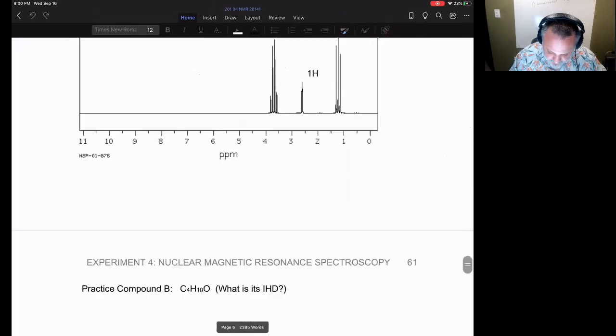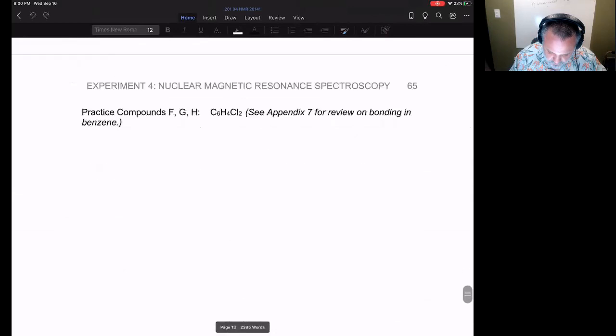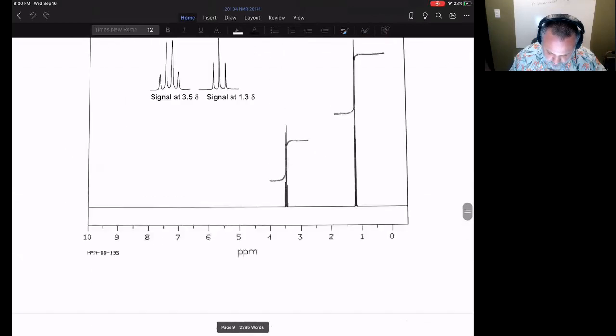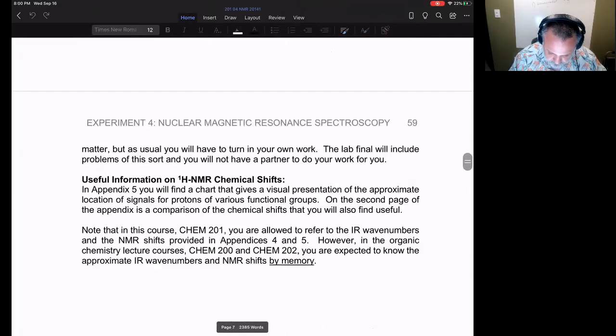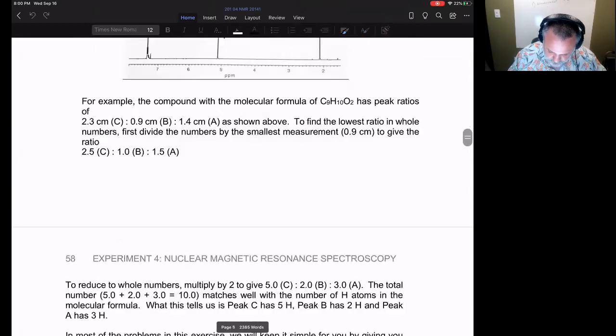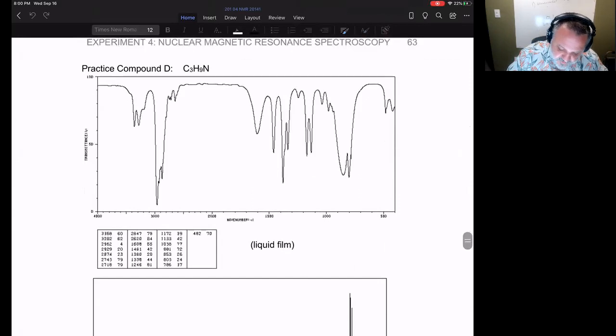So if I go back to this one, let's see. Where was it? There it is. What's the index of hydrogen deficiency?